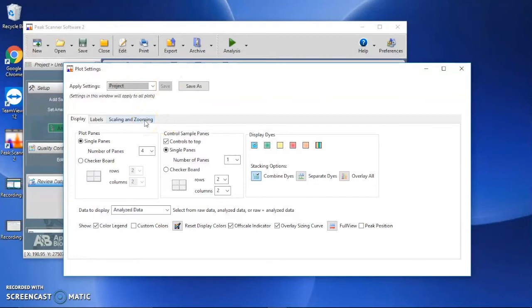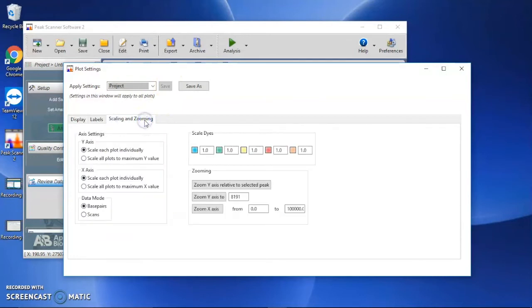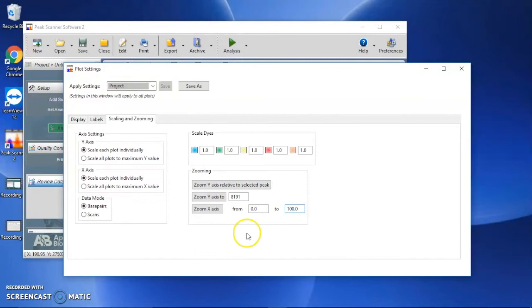Click Scaling and Zooming. Zoom the view by changing X-axis settings. For example, I want to view the peaks in the range of 0 to 100 base pairs for this case.